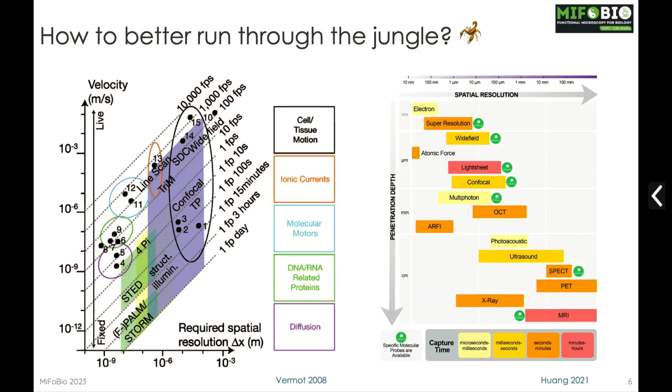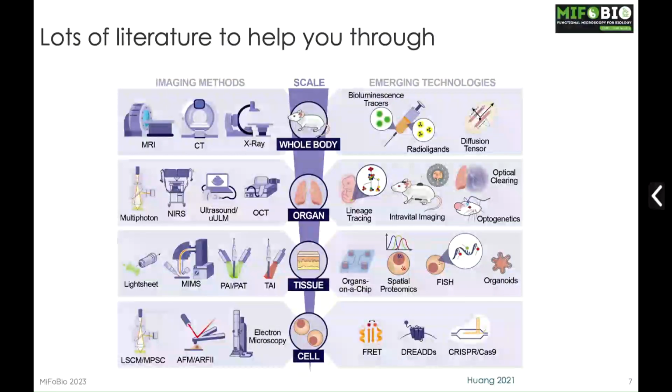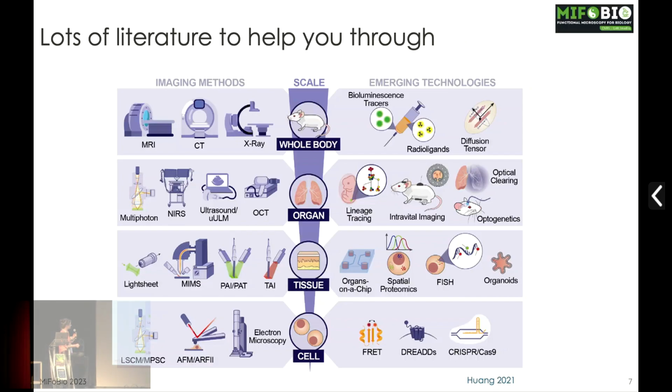It's kind of tricky, but there are many reviews in the literature. This one is very new. It's a bit busy, so I won't spend time describing it, but depending on the scale, you have dedicated imaging methods that indeed cover the light sheet, the multiphoton, which I will stress a bit.